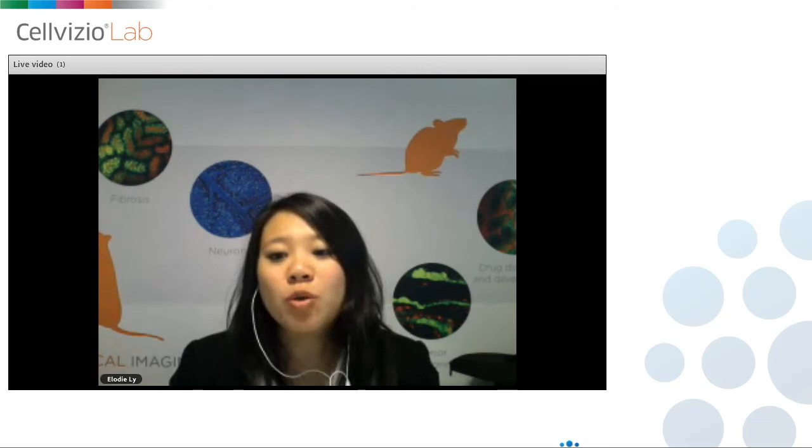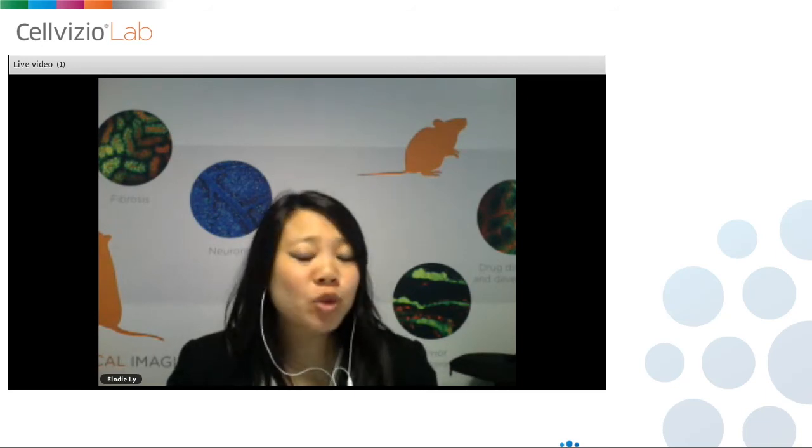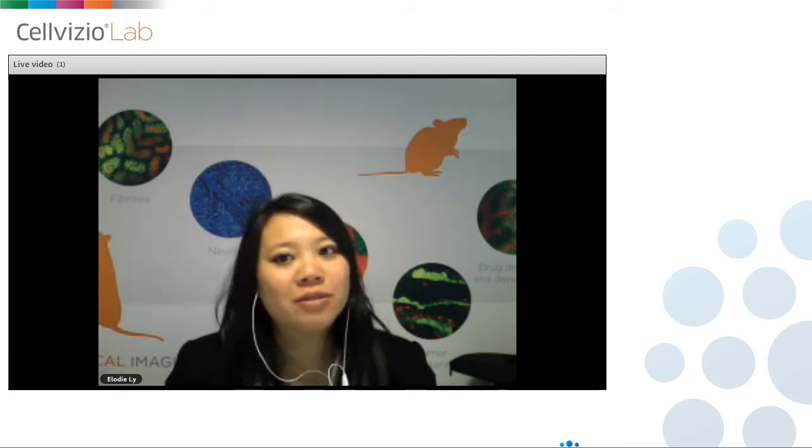I have one question regarding wavelength. We have two wavelengths with a dual band instrument, 488 and 660 nanometers. These are available in the standard configuration. For other wavelengths, you should contact us, but that requires some development. So in the standard configuration, it is only 488 and 660 nanometers.